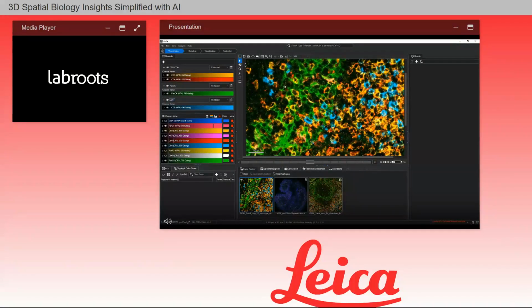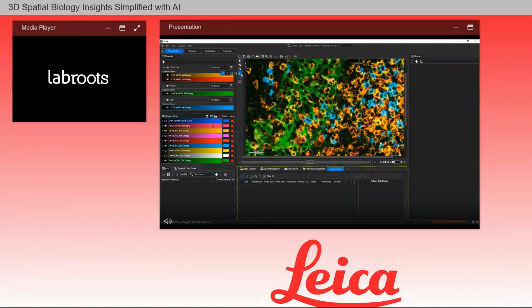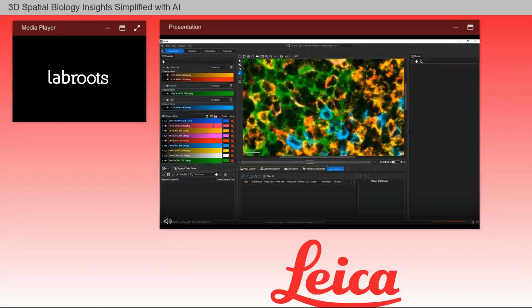This toolbar can access the available on-screen tools for the image view in Aivia. And when I mouse over annotations, I can then select one of the tools. This will bring me to the annotations tab. I can use the line tool then to manually measure the diameter of my cell.